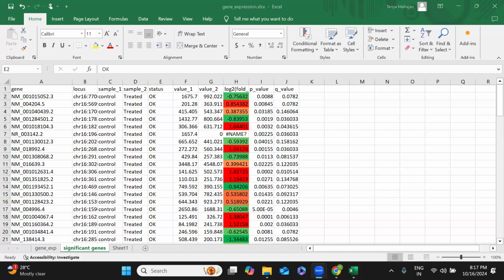Priyadarshini, yes ma'am. You have the problem again? No, ma'am. I have done what you said. Okay, fine. Now, second step is to do the annotation part. So what is the annotation, guys?